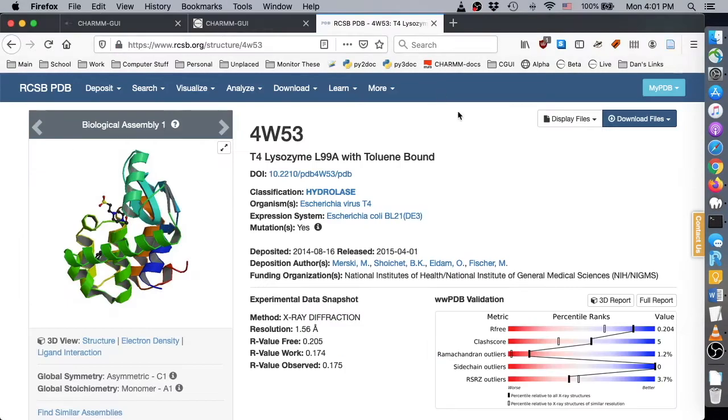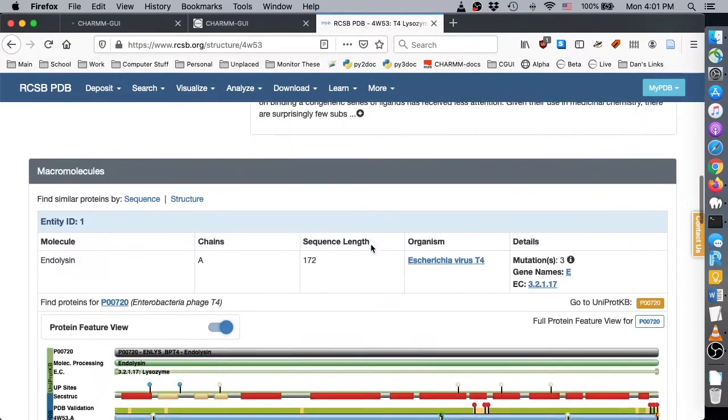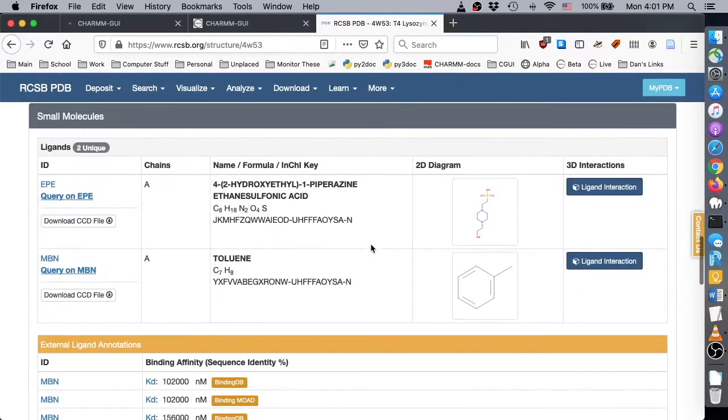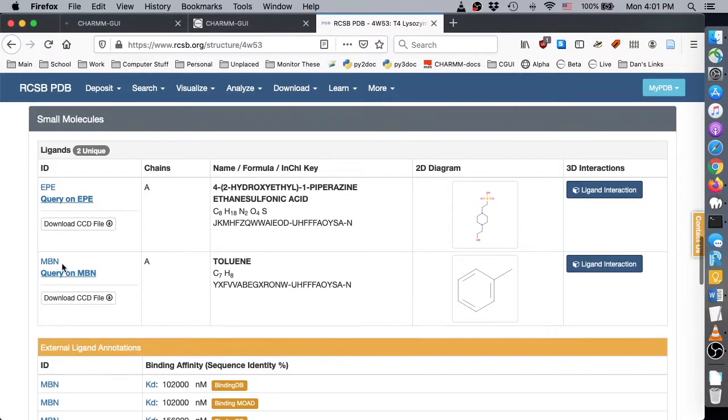This video covers absolute ligand binding between T4-lysozyme PDBID-4W53 and toluene derivatives. On the RCSB page for this protein, you can see two small molecules, a buffering agent and toluene. We will use the pre-docked toluene structure as a basis to test similar ligands with a longer alkyl chain.